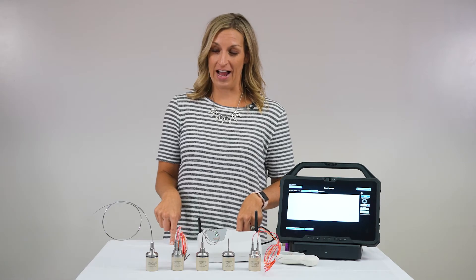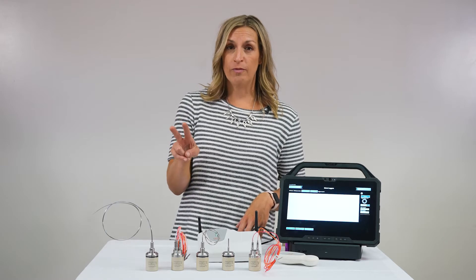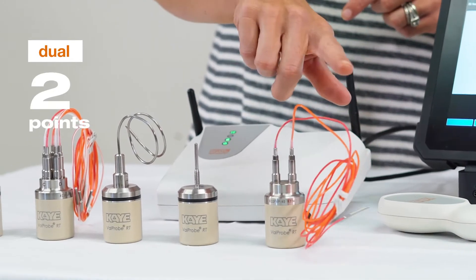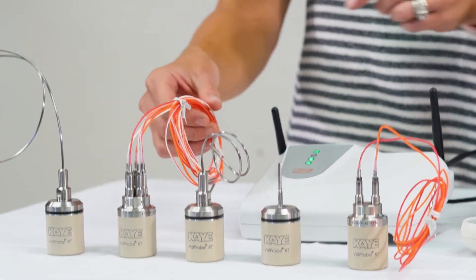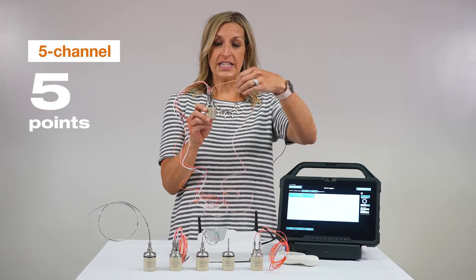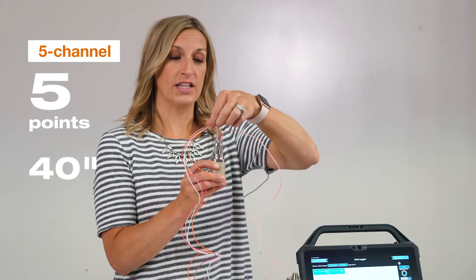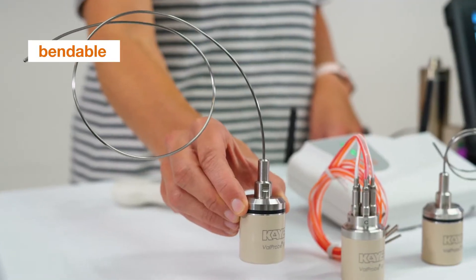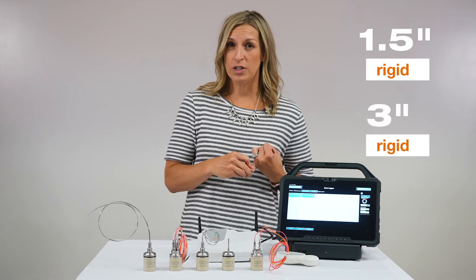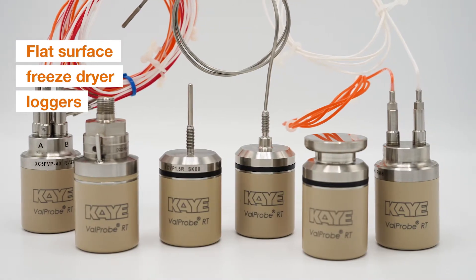Within the real-time valve probe product line, we have an array of sensors for your applications. Two newly added options are the dual logger, giving you two points per one valve probe, and our most popular — the five-channel logger, which gives you five points on one valve probe using a 40-inch ultra-flexible design to hit five spots in one area. We also have the bendable, the 1.5-inch rigid, a 3-inch rigid, and our flat surface freeze dryer loggers.